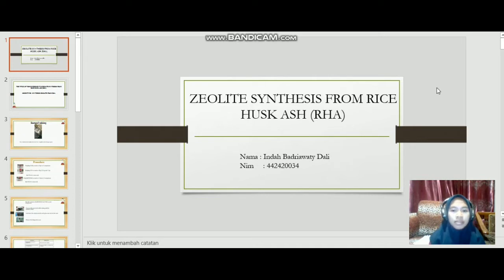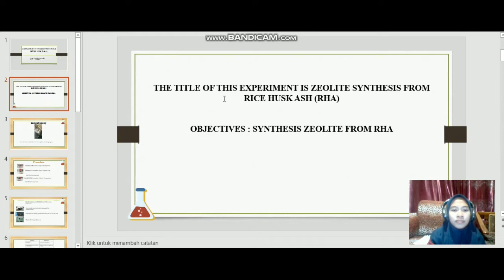My name is Ina Bariawati Dali. I'm from class Kimia Unit B. I will give a presentation about zeolite synthesis from rice husk ash, or RHA. The title of this experiment is zeolite synthesis from rice husk ash. The objective is to synthesize zeolite from RHA.